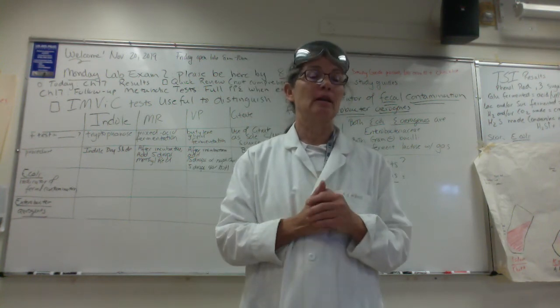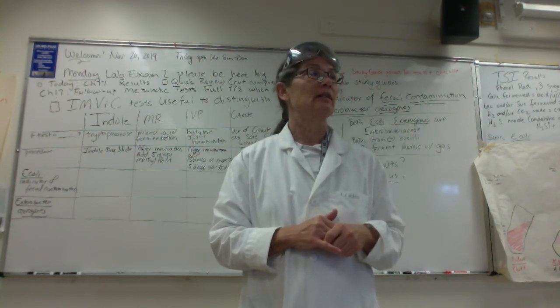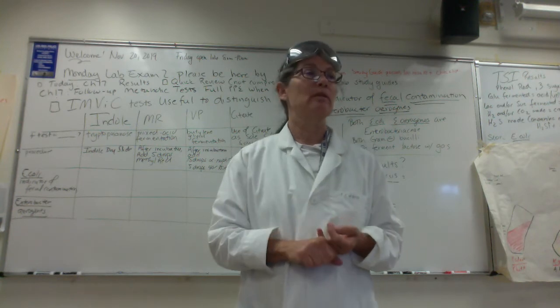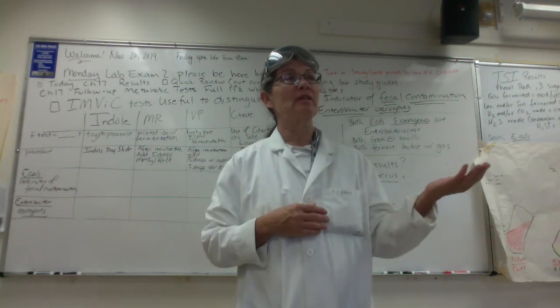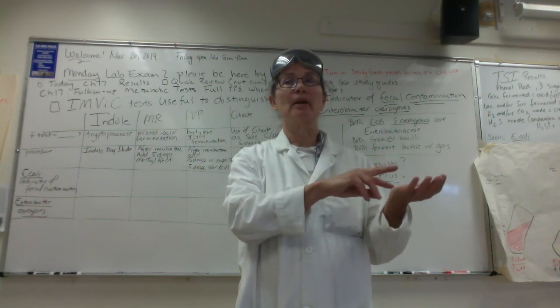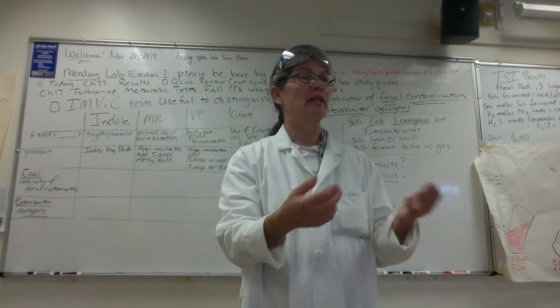And if the indol dry slide did not turn red, what does that tell you? It's a negative indol test. And what does that tell you about your microbe? It doesn't make tryptophanase. Exactly. So you guys, that's the interpretation. So the appearance is how does it look? Like what color it is. And then I want you to tell me, is that positive or negative? And the interpretation, the significance. What does it tell you about your microbe?